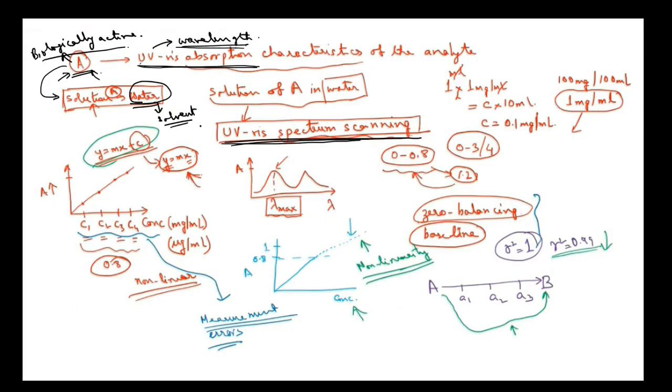In that case, the system will initiate the absorption measurement at 180 nanometer and scan through up to 800 nanometer.